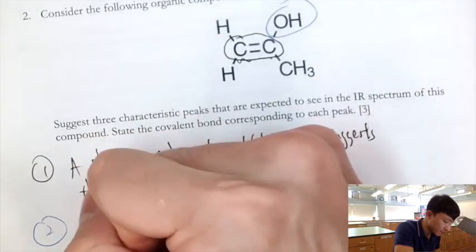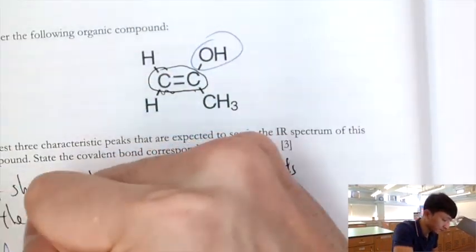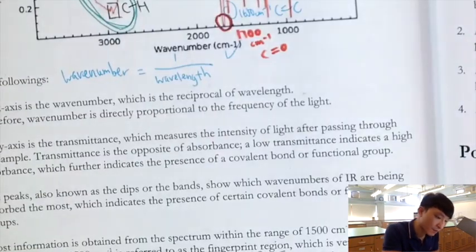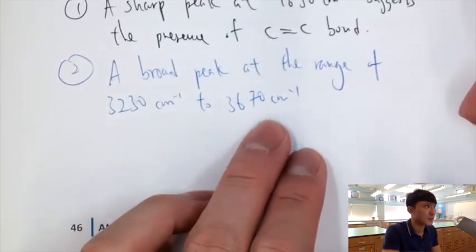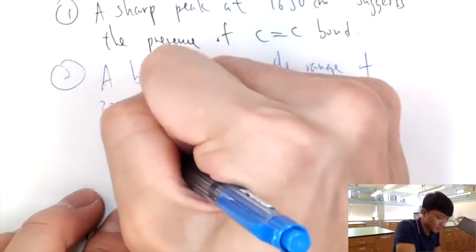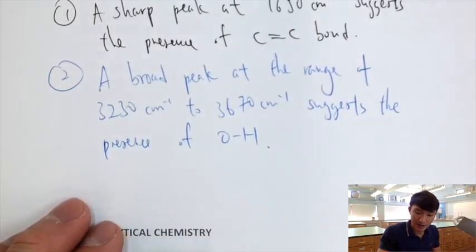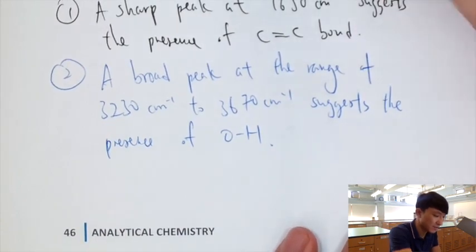You can just copy from here if you're not sure. So it suggests the presence of OH.